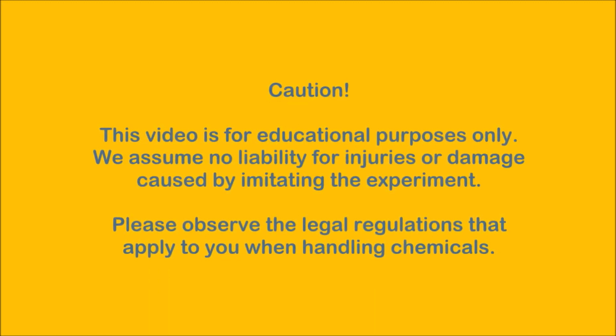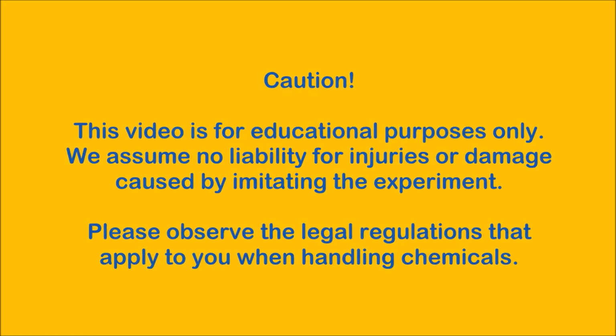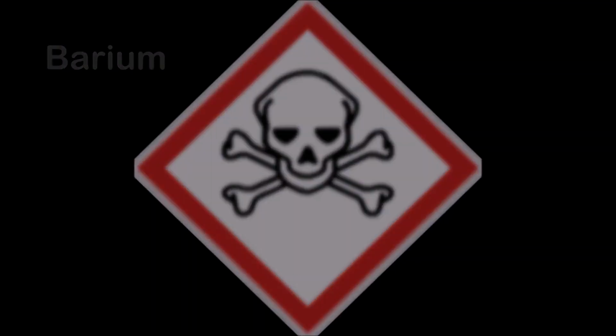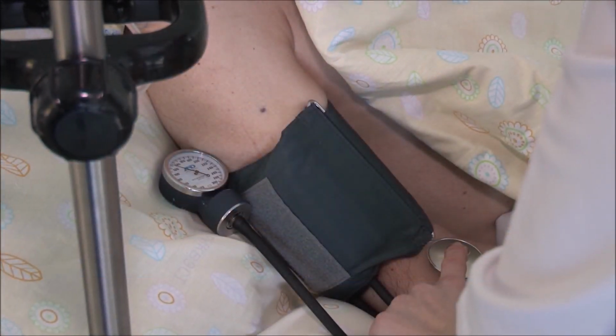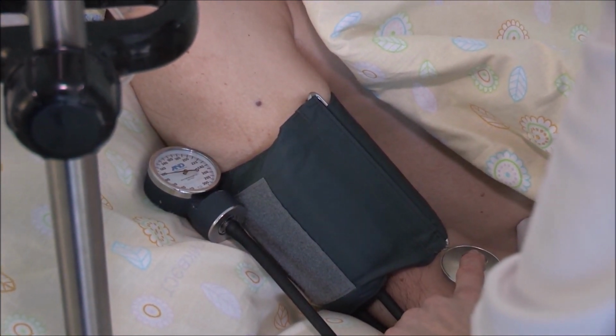Anyone who knows this channel already knows this warning. If you are here for the first time, please skip back and read carefully. Barium and its water-soluble salts are toxic to the human body. When taken orally, acute stomach and intestinal problems occur first. Usually it then continues with an increase in blood pressure, with a reduction in heart rate and muscle cramps.